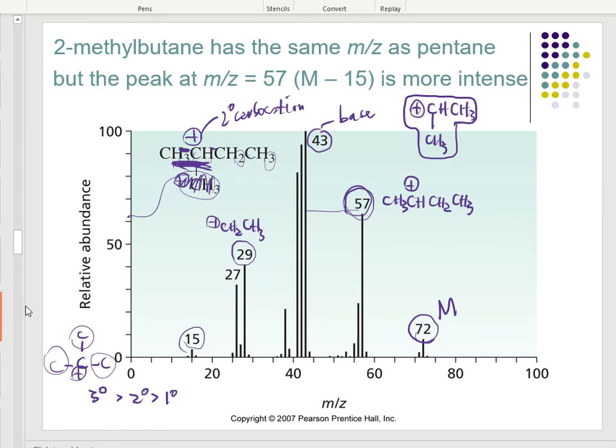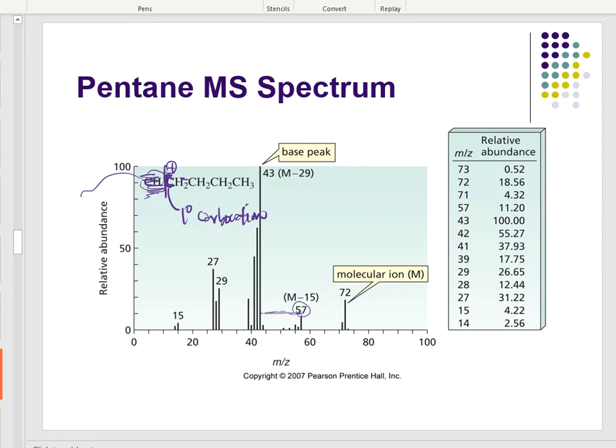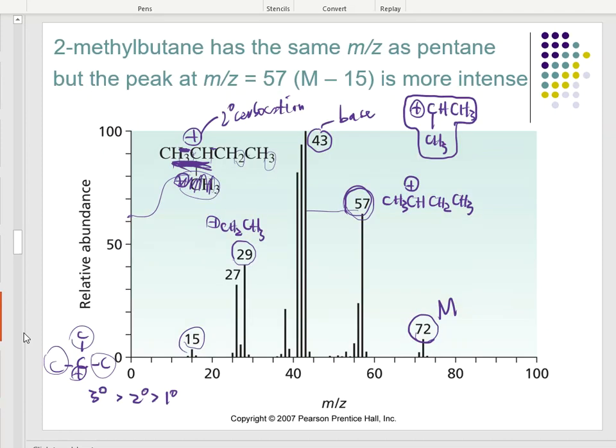It feels more trusted. Yes, I can trust you to go on your own, do what you need to do. You got some extra buddies that are going with you. Hopefully nothing stupid's going to happen. Here, it's a different story. If the molecule cleaves that one carbon and makes it go away, this carbon is more exposed. This carbon has more of a chance to go to the club and get in trouble, whatever you define trouble as, versus the other molecule. That is why this 57 is much lower, and that's why this 57 is much higher.